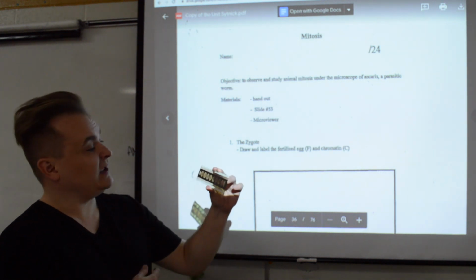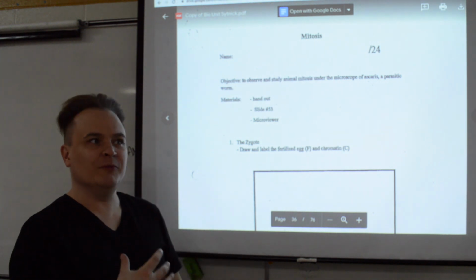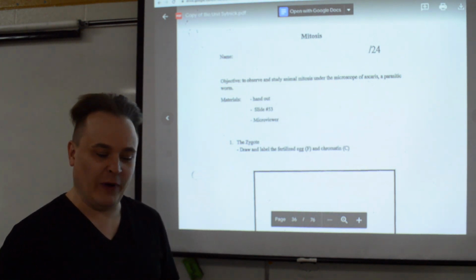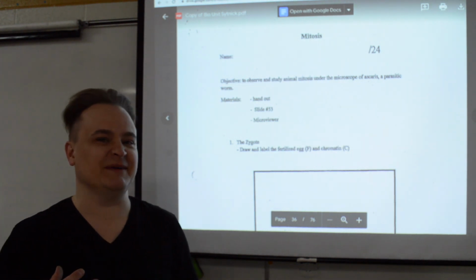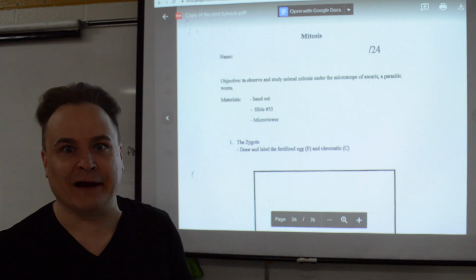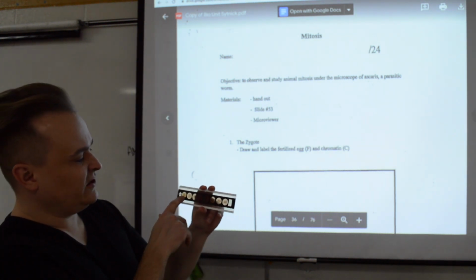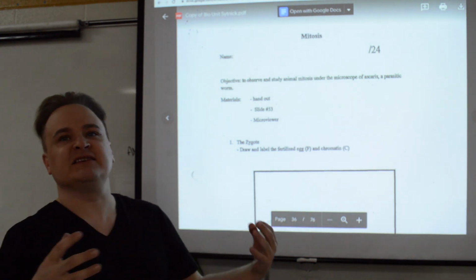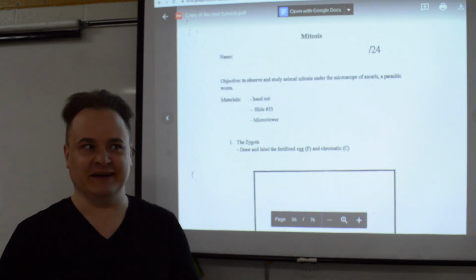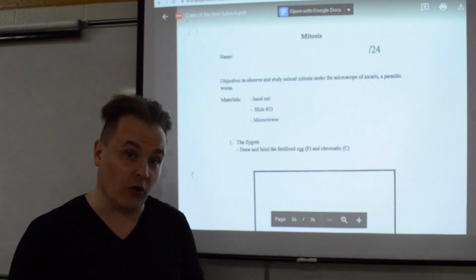So what we are looking for is we're going to look at this worm cell. Now, humans have 23 pairs of chromosomes. Ascaris have way less than that. And the reason we're using that is because it's much easier to see a few chromosomes as opposed to 23 pairs like in a human cell. So we're going to use a worm. So you look at the worm cell and you're going to see it line up, and it's going to go through interphase, prophase, metaphase, anaphase, telophase, cytokinesis, all of that stuff. But you're going to see it in the real world.